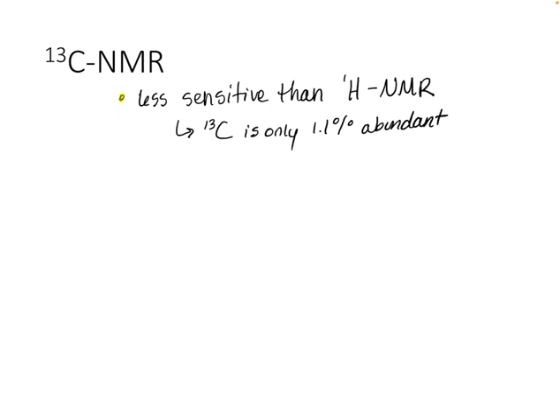They're everywhere, or at least hydrogens with a mass of 1. So it is difficult to detect carbon-13. Now, in carbon NMR, there's usually no splitting like we have with protons.